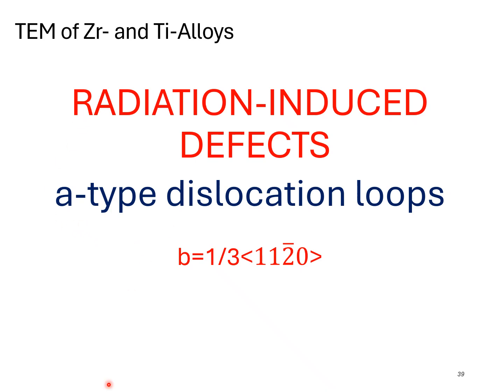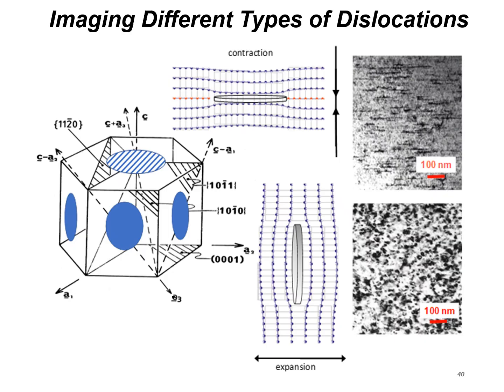Okay, talk a bit about radiation defects. I'm going through this without digging too deeply into the diffraction theory, and I hope you know enough or can pick up enough to get something from what I'm talking about.